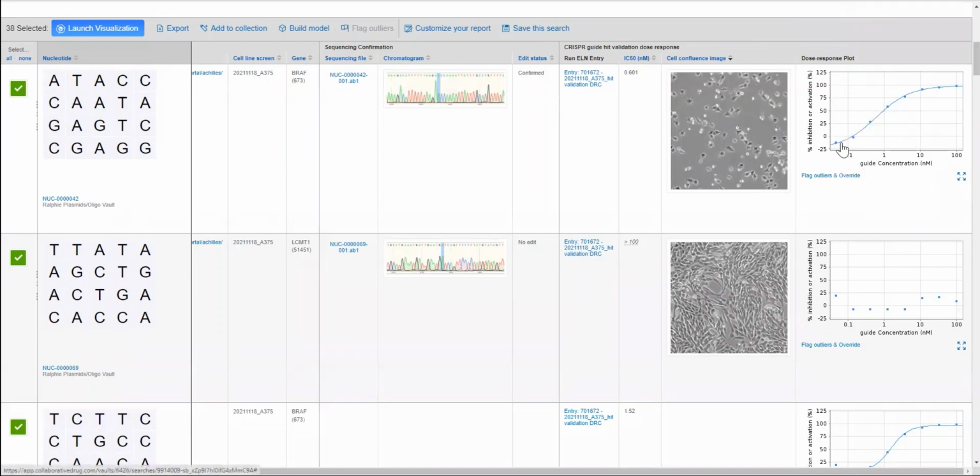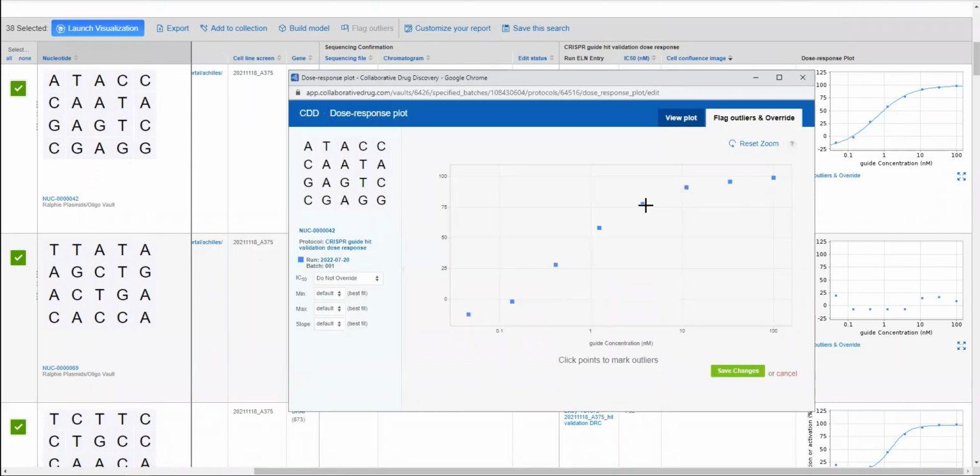Simply provide us with an X and Y, and we will fit the 4-parameter logistic regression and give you any intercept like an IC50 that you are interested in. In addition, this raw data can actually be QC'd live within the CDD Vault system. So you can come here and select certain data points to flag as outliers, or even override an entire IC50 curve.